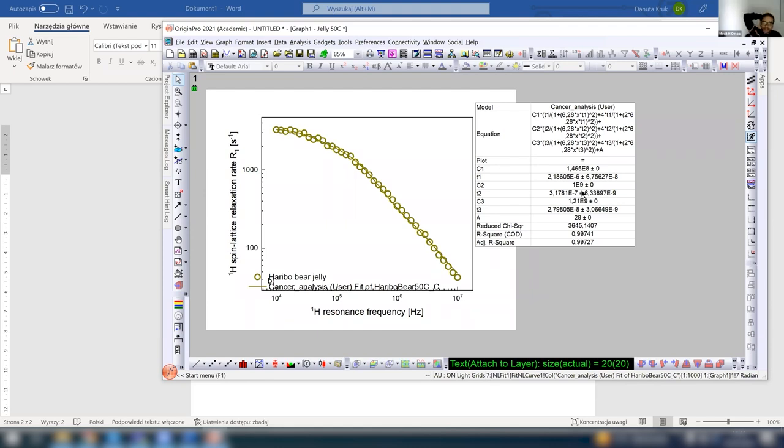Danuta, can I have a question? Sure. So you started with, maybe you already mentioned in the beginning, I missed, you started with 3 contributions. I mean, the higher number of contributions eventually will make it more difficult to interpret, especially in food systems. So what would you recommend, like starting from 2 and increasing it, or just 3 will be a good point normally?